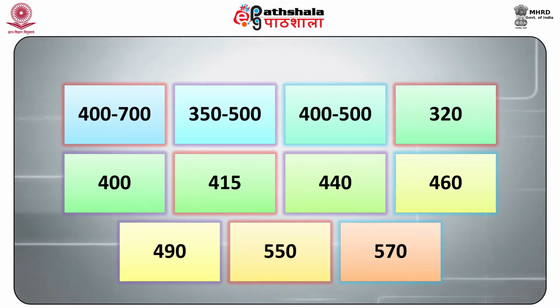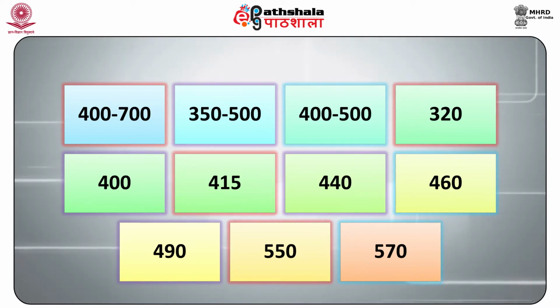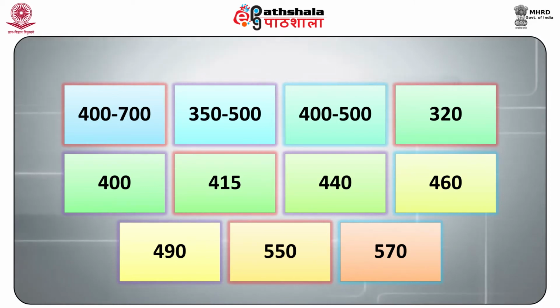In combination with the 11 excitation settings, white, that is below 400 nanometer, orange, that is below 500 nanometer, and red, below 590 nanometer, were used to block the excitation light and to visualize the fluorescence more precisely.